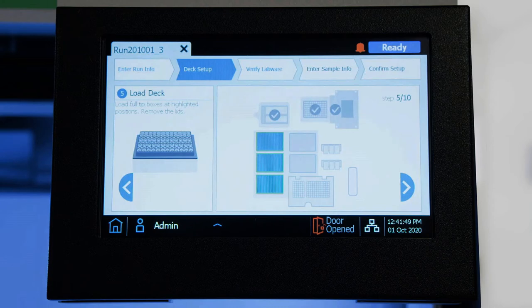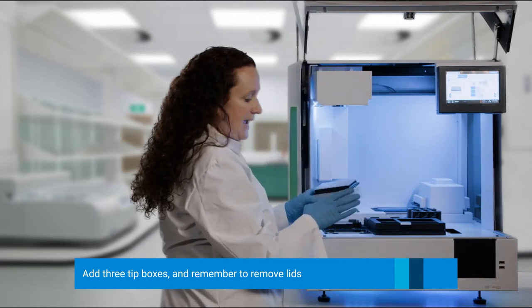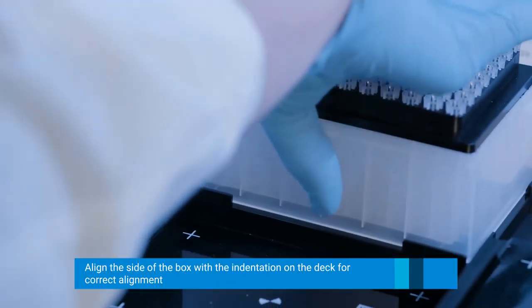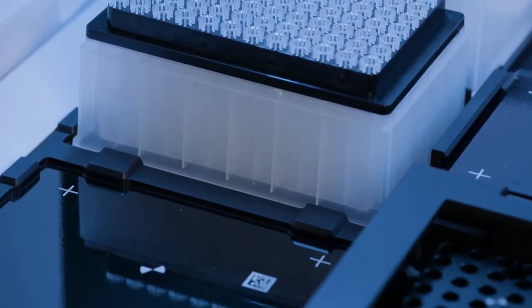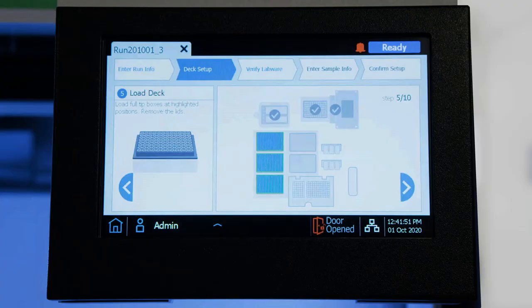Now we are going to add the three tip boxes. It is very important to remove the lid once you add them, as well as lining up the bottom of the box into the indentations in the deck. We will add all three of them as indicated on the touch screen for this protocol. Click Next.